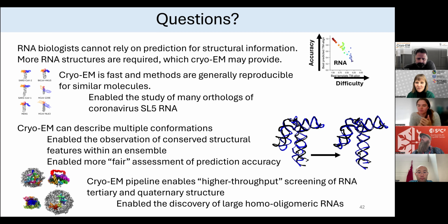Combined with the global fold we're able to see from cryo-EM, we can now really start targeting, for example, drug targeting, which with low resolution cryo-EM is not necessarily that informative. So I think that is the way a lot of these flexible or low resolution RNA cryo-EM maps should go if we want more atomic level resolution. But large RNAs you can already solve to atomic level resolution with cryo-EM, so for those, maybe just stick with cryo-EM for now.